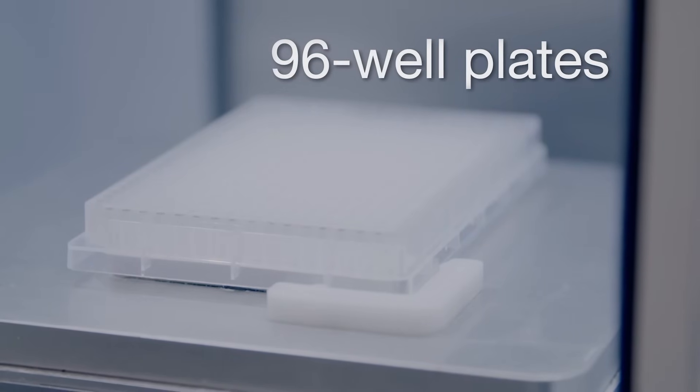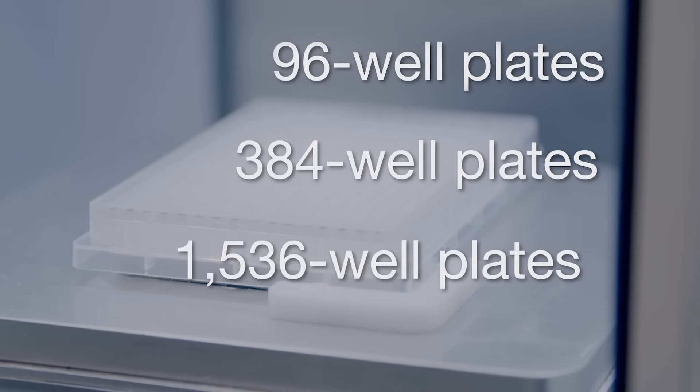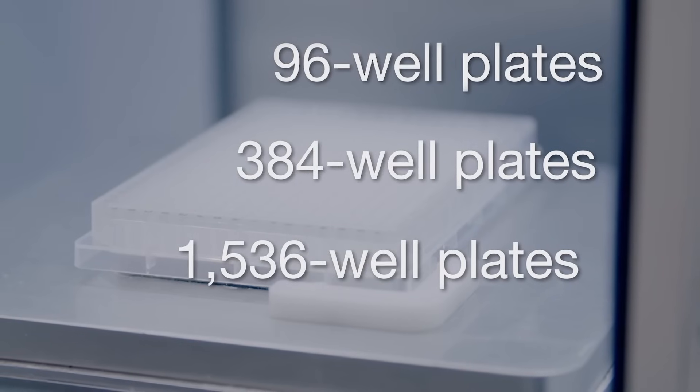The Bigfoot Spectral Cell Sorter can also perform 4-way sorting into 96 wellplates, into 384 wellplates, and straight-down sorting into 1536 wellplates.